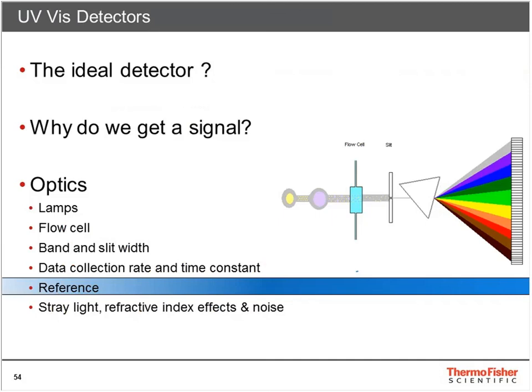Reference wavelengths. This is another difficult topic because it can give both advantages and problems.